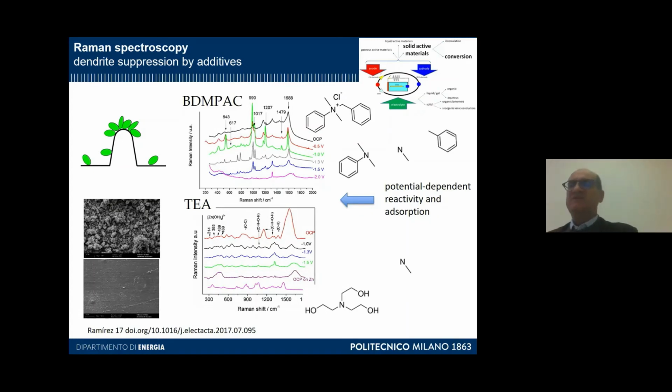The limited surface sensitivity of non-SERS active electrode surfaces calls for vibrational spectroscopies with intrinsic surface sensitivity and capability of resolving surface orientations.